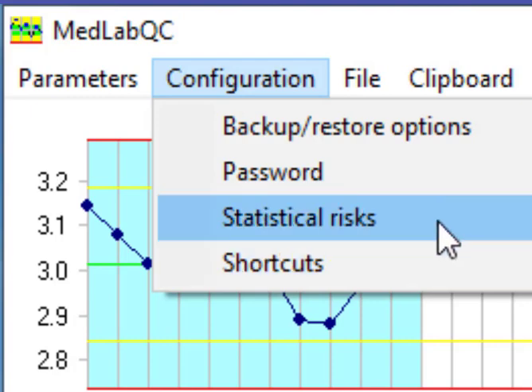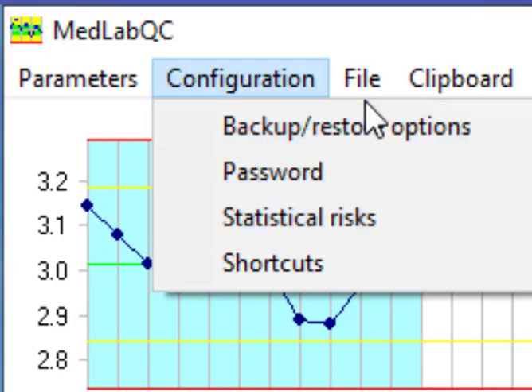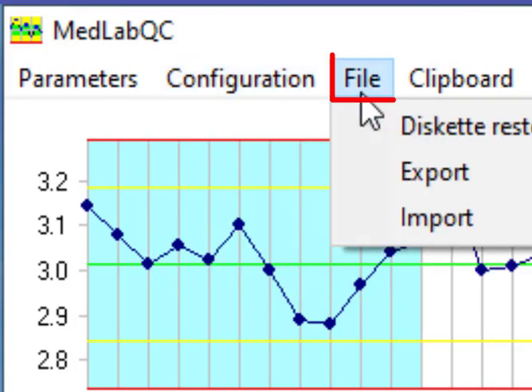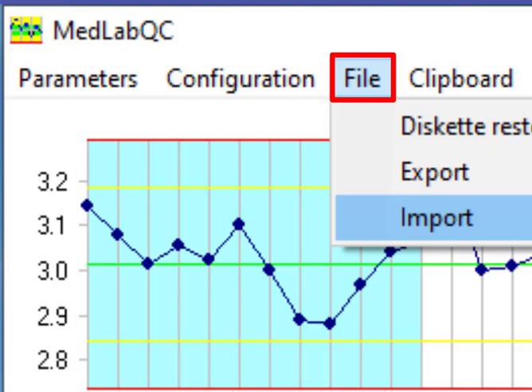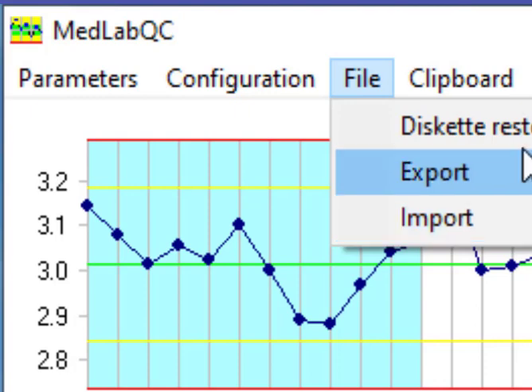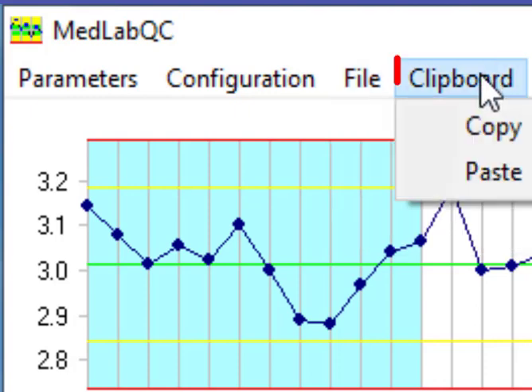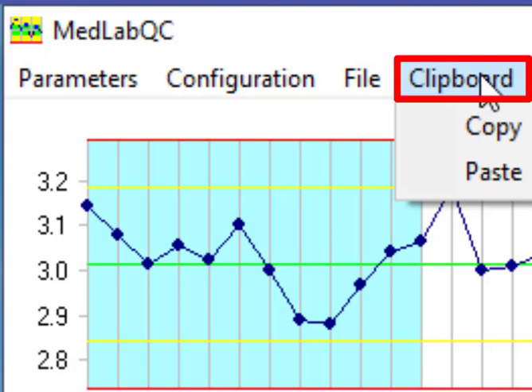We have a statistical risk which is related to confidence interval which is usually determined at 95 percent. File is for export data and also to import data from specific formats. Clipboard is for copy and paste data.